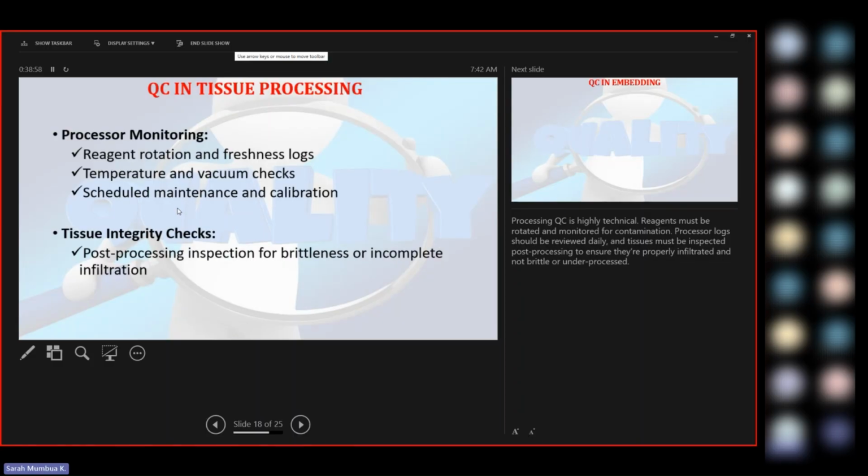If you're doing clearing, xylene will come and find the tissue on the stationary point. So remember, this xylene is mixing with these tissues over and over and over. So you have to change it after some time. Make sure you track how many samples you have run. So if in your lab you decide I'll change every 1,000 samples or even every 200 samples, track the samples.